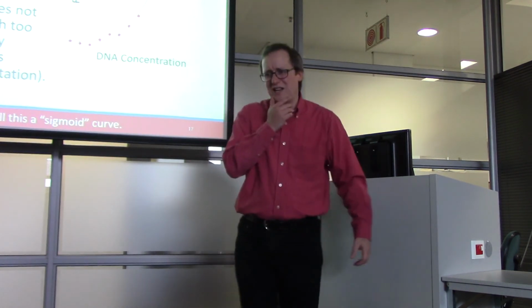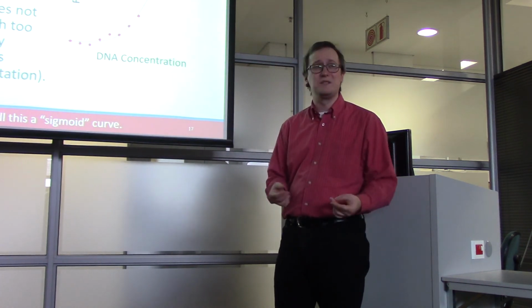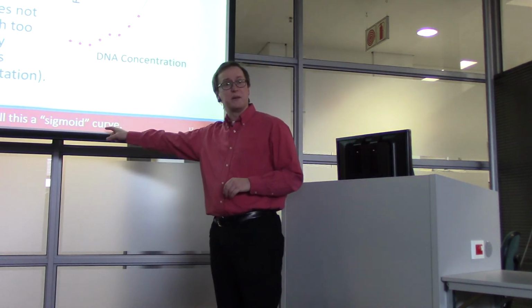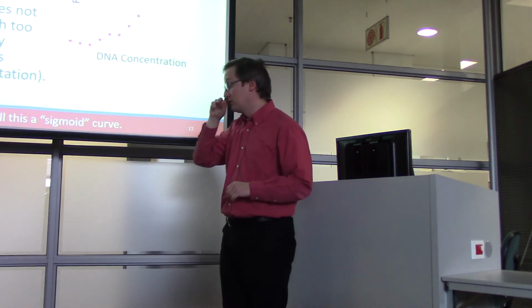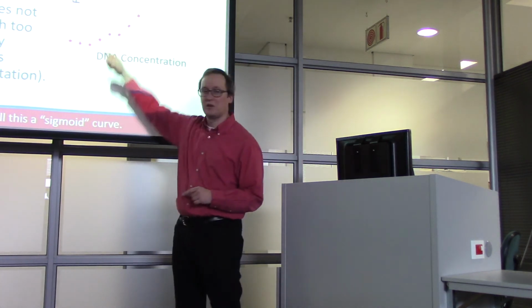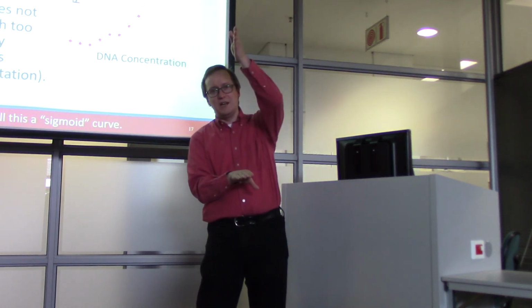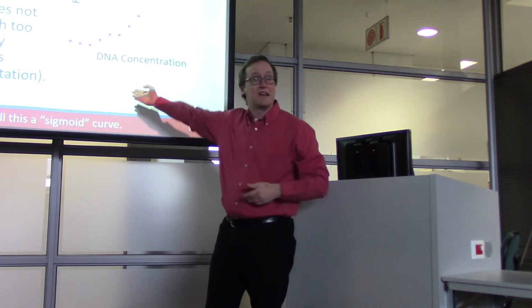This area seems to be a bit of a Wild West right now. So this is going to be a lot more associated with general principles of quantitation, but I hope that it's still useful. So you've heard the term sigmoid curve, perhaps? Sigmoid? Yes. All right, this is an example of a sigmoid curve. So we have some amount of DNA in our sample, and we have a detection that we're using, read count for this example. And we want to know, does the number of DNA read counts rise as the amount of DNA rises? Yes.